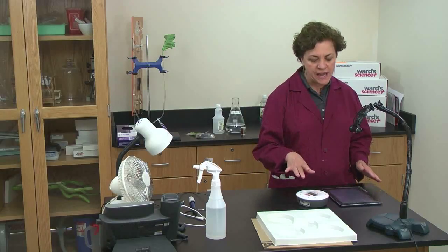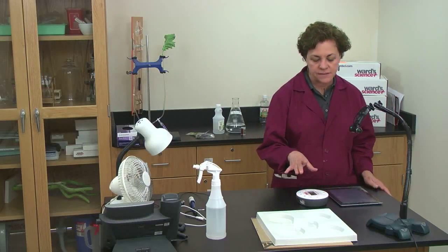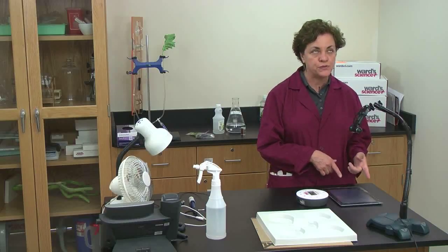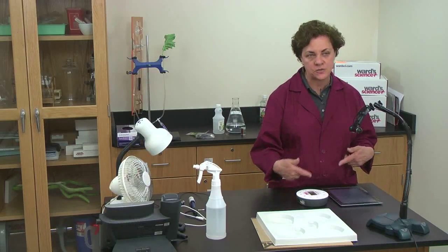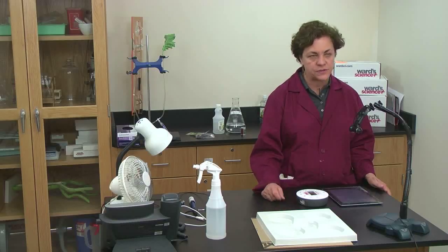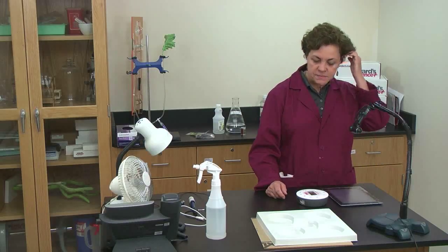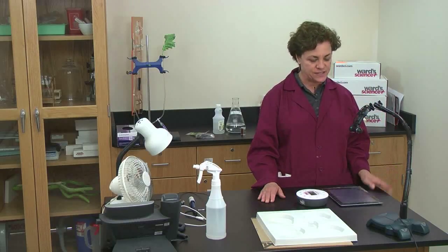Then you pair your iPad to the Datahub itself via Bluetooth. Any Bluetooth device will connect with this, so you could even do it on phones if you wanted your students to access it with their phone instead. These are always wirelessly transmitting, which makes it easy, no wires to trip over.